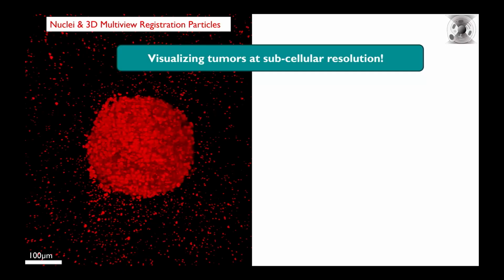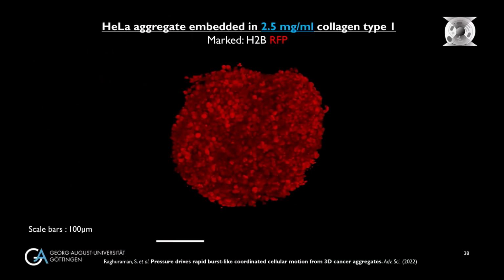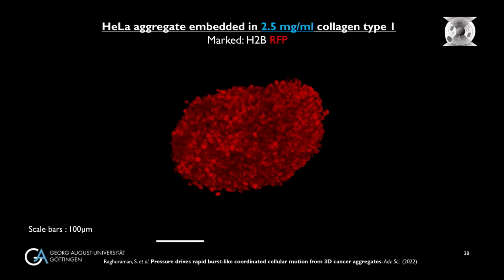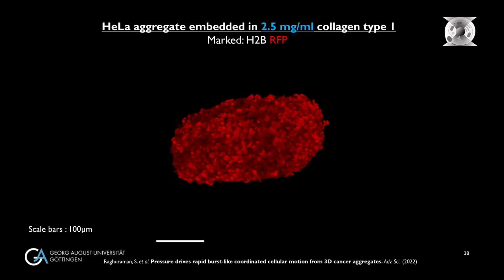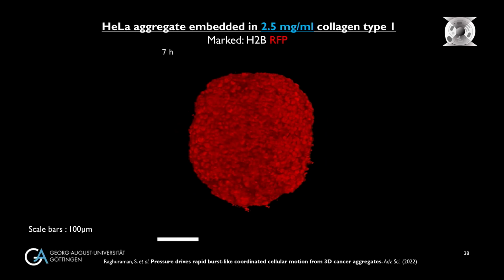And just to show that this is not in thin air, all of this would be the imaging here of the collagen around it. So in reality, our spheroids are more like little pancakes. This is what they look like from the side, but you can now very nicely look at this. And you can also take a movie over time.